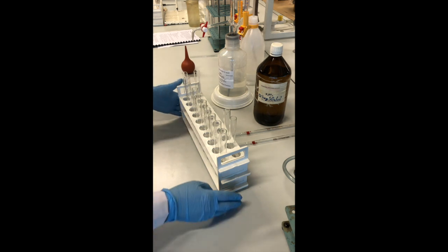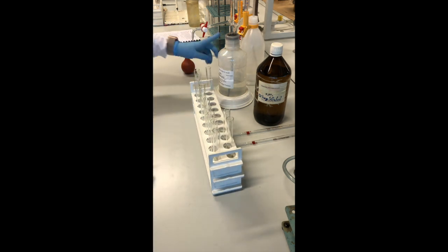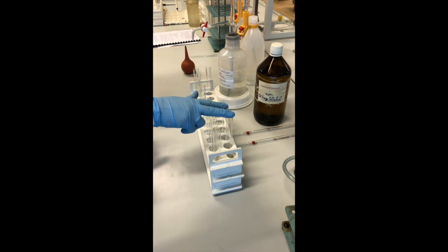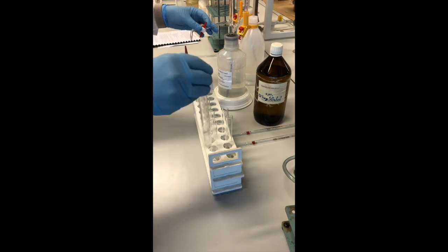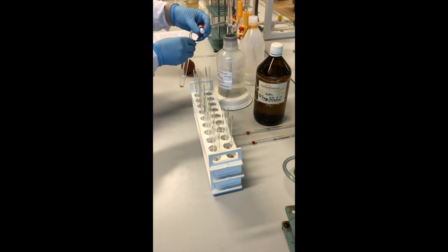The next step is adding 0.5 cubic centimeters of the hydrochloric acid to the scale of standards and our samples. So we add 0.5 centimeters to each. You mix the sample.